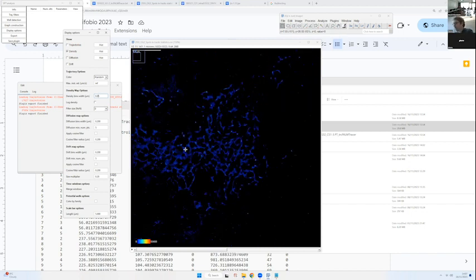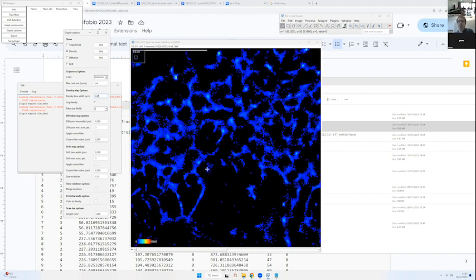Here I'm at 50 nanometer. You can see here I have more resolution. And when you display a map, you will get a color bar that appears at the bottom left of the window, and you see here the minimum value is 0 and the maximum is 56,000.